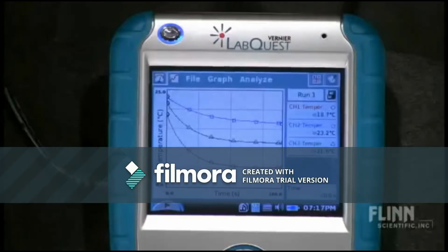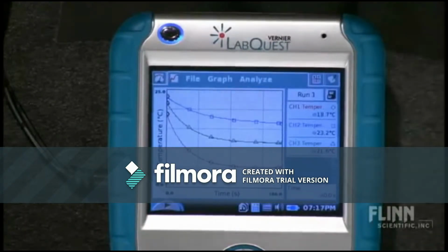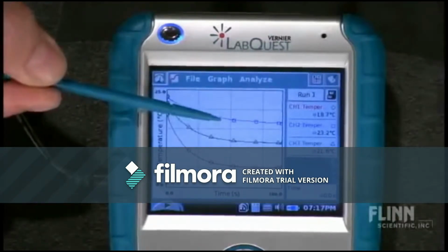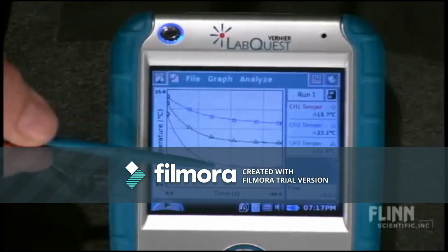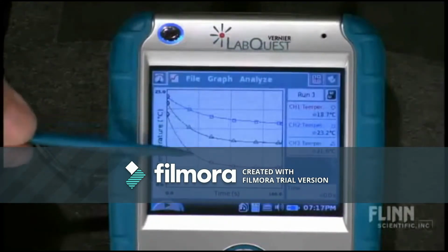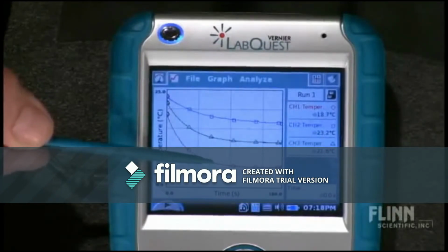All right. The experiment's over now, and we can see that the 3 alcohols did evaporate at different rates. One alcohol has only changed its temperature very slightly. There is a decrease as evaporation has occurred, but it's not a large decrease. In contrast, this alcohol has really changed temperatures. A lot of particles have evaporated, gone away to leave the cooler particles behind, and a much greater decrease in the temperature of our system.